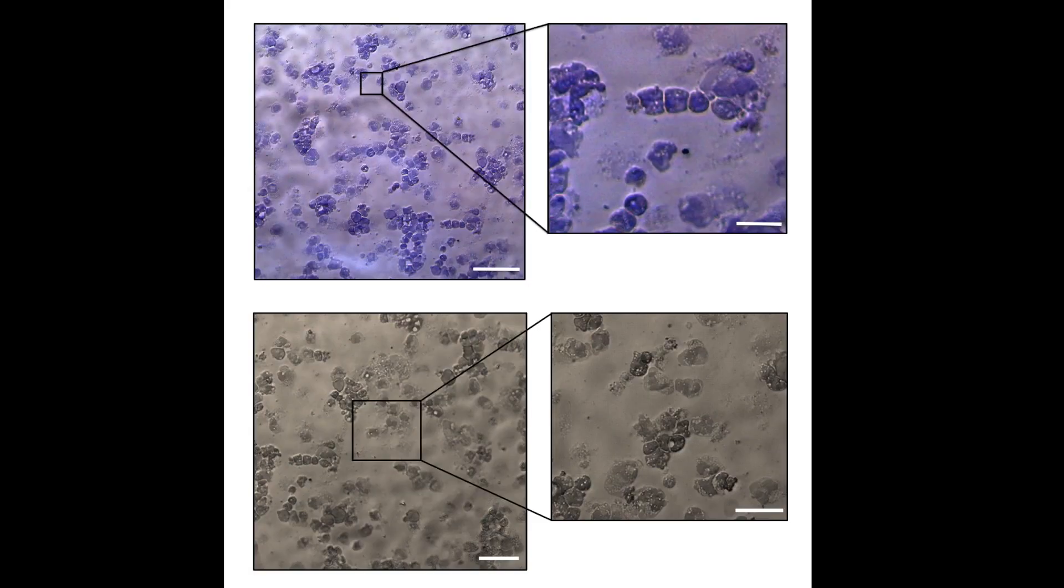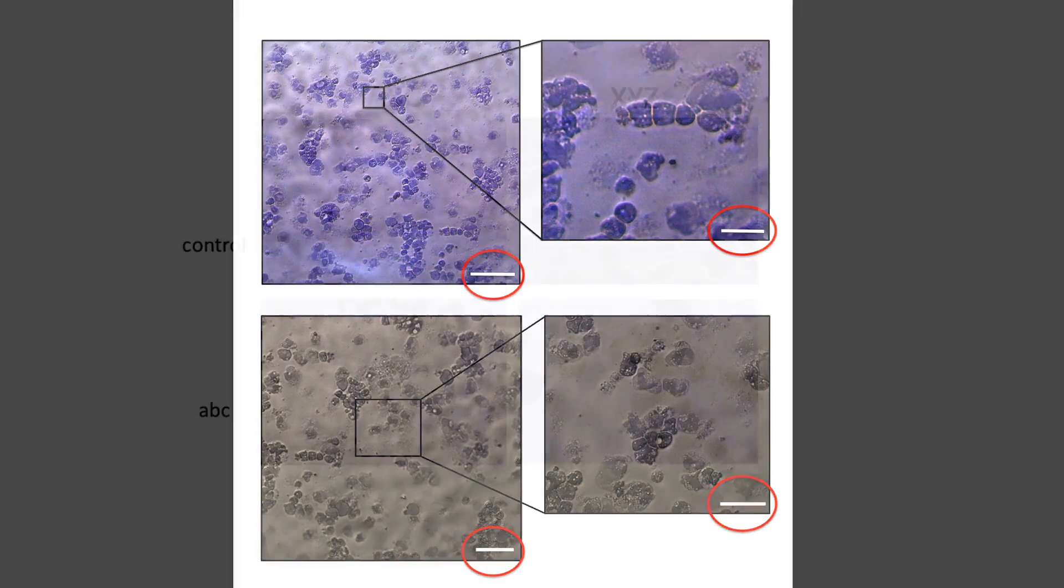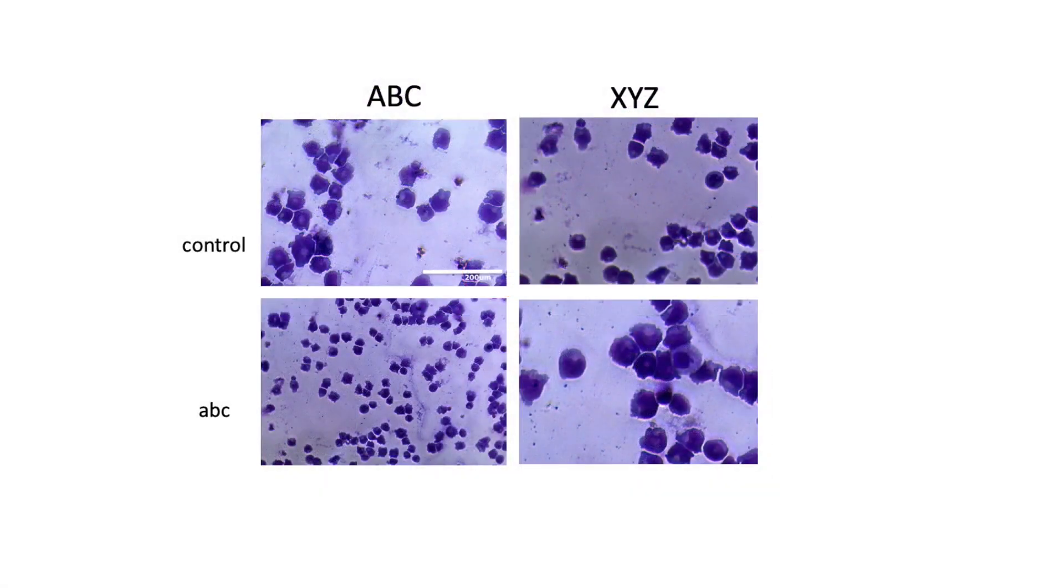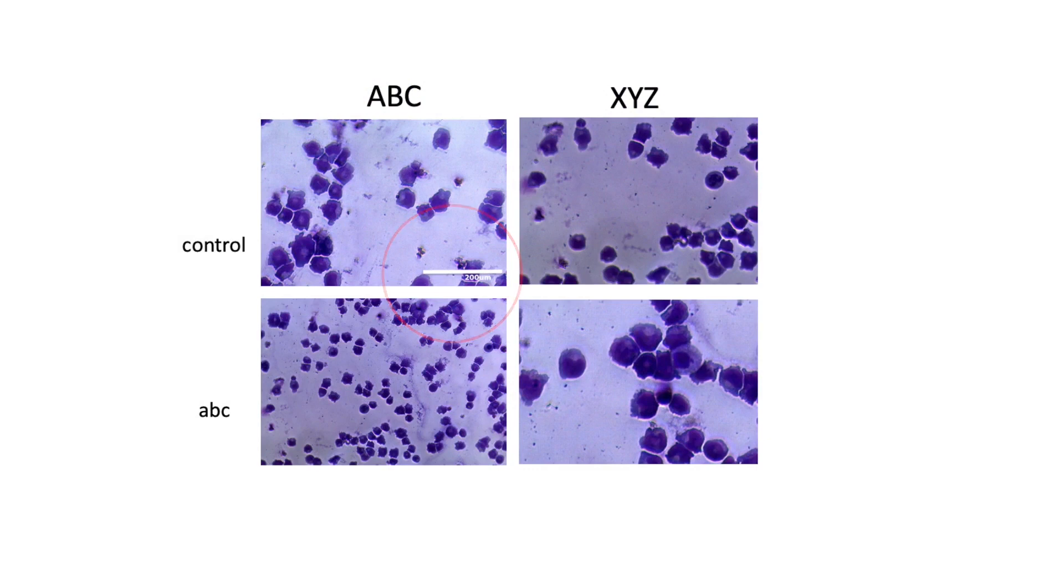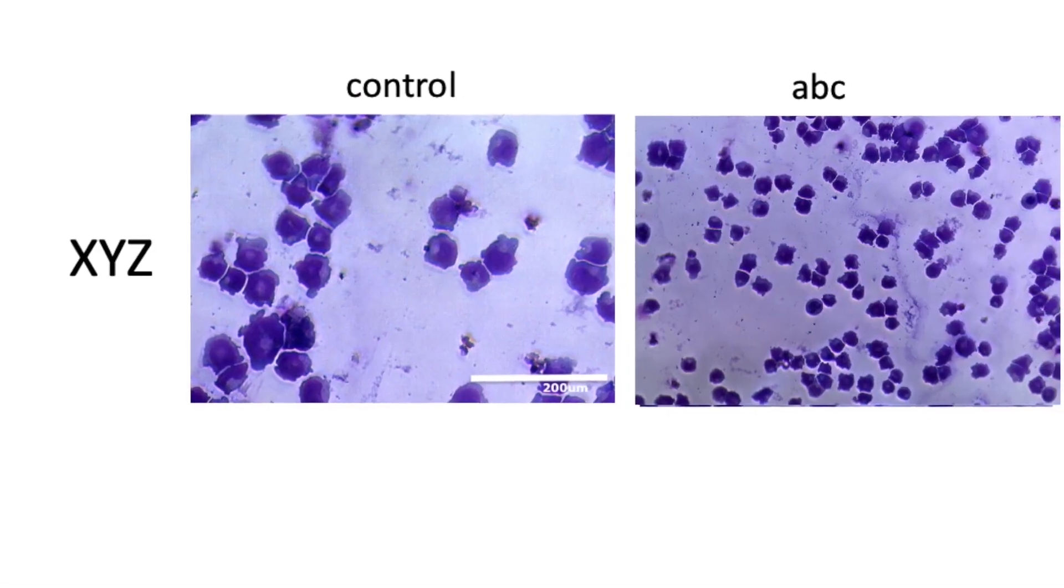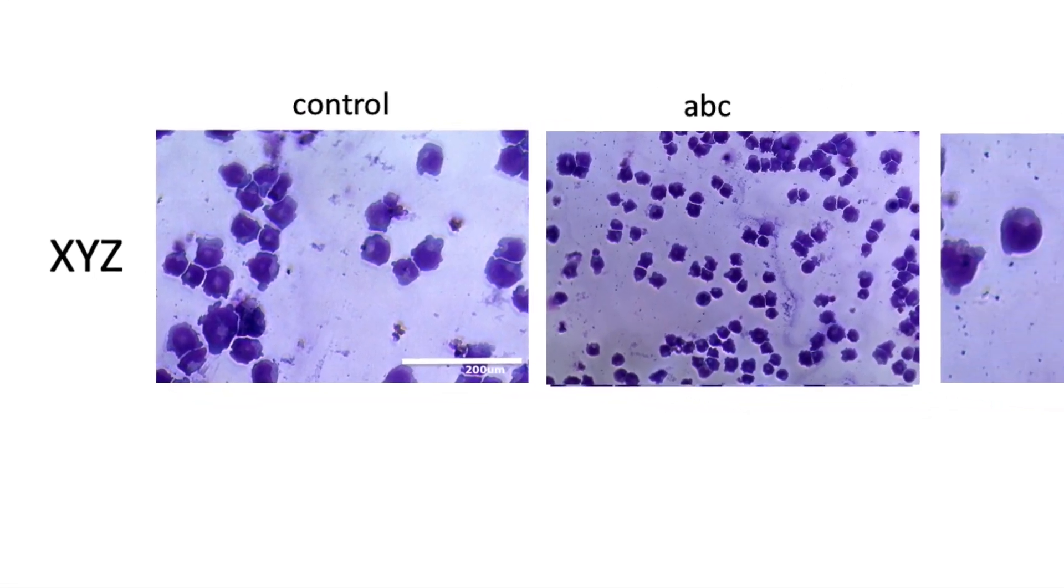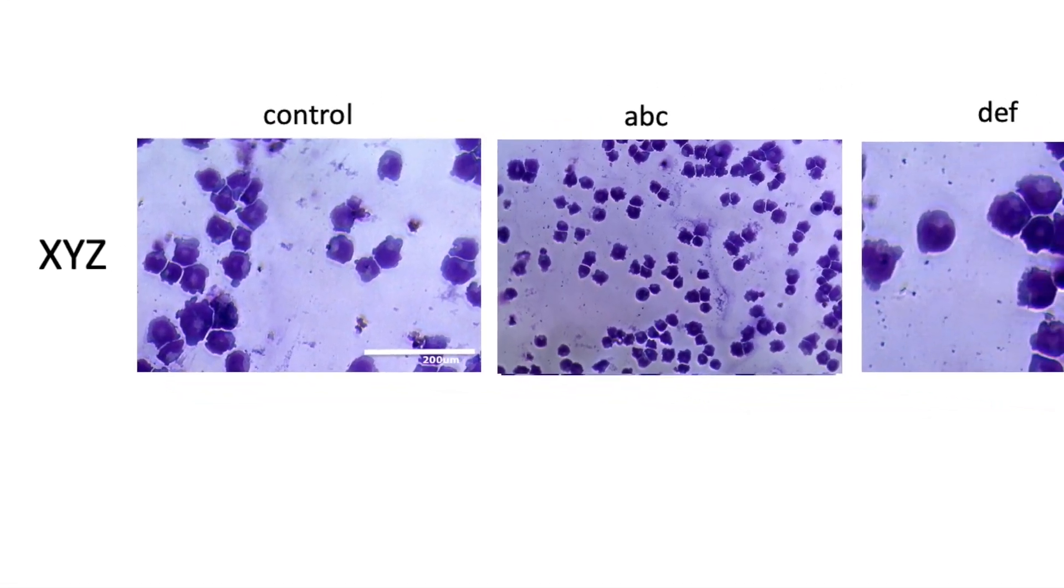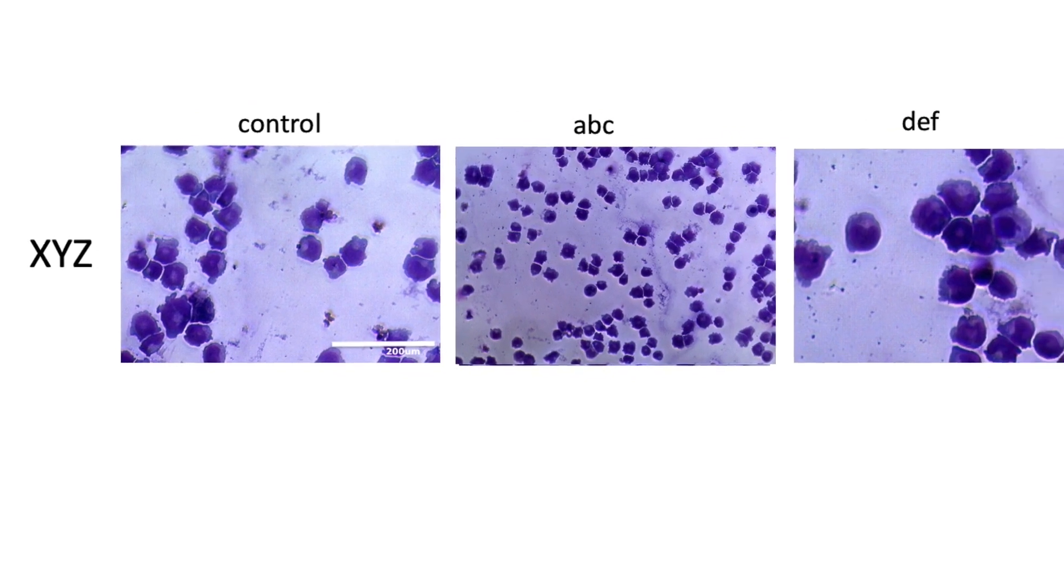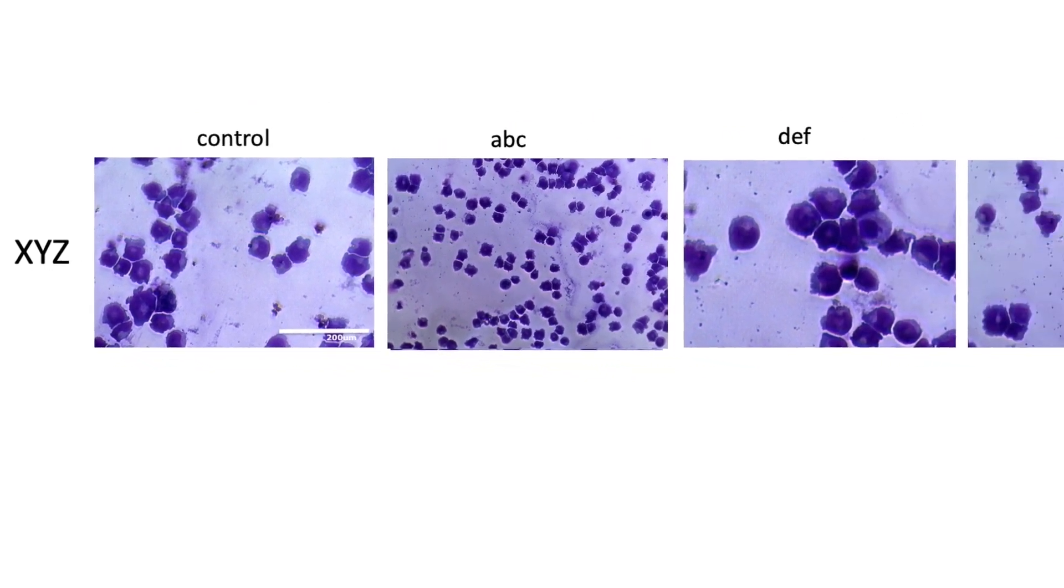Also pay attention to scale bars. They are sometimes incorrect, illegible or even missing altogether. You should watch out for that. If only one panel in a group of images has a scale bar, then it should apply to the whole group. Ensure that this is plausible and that the individual images are indeed all shown at the same magnification.